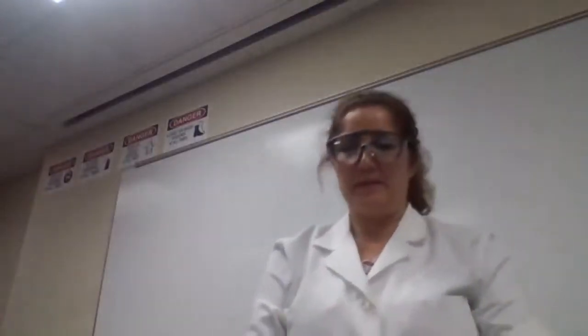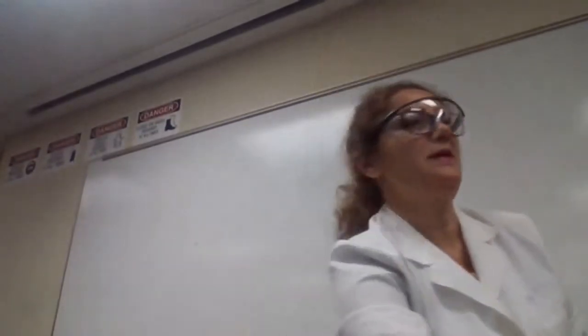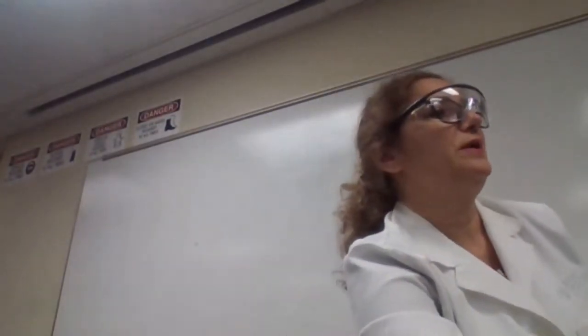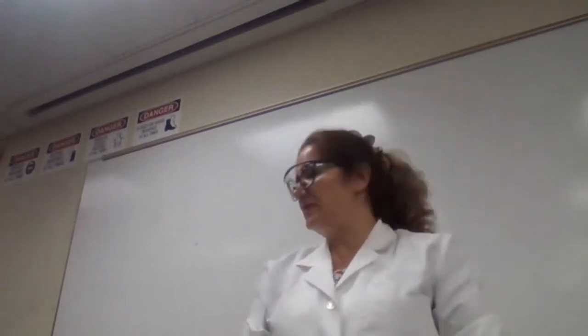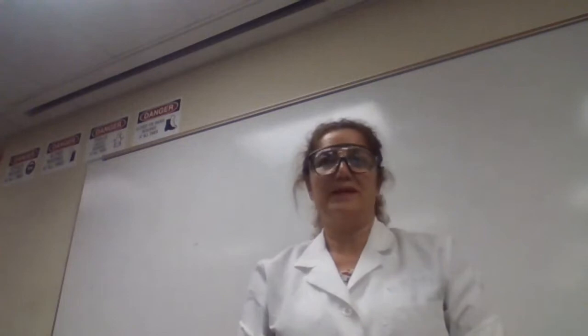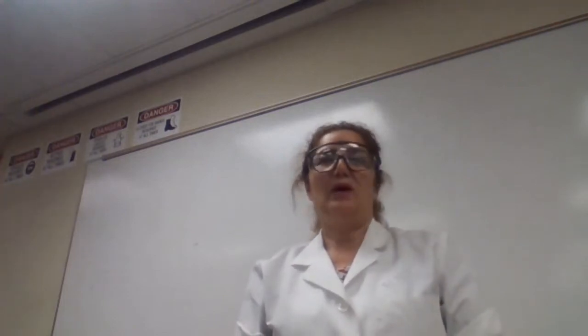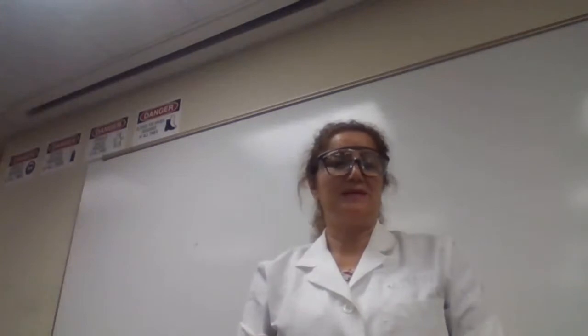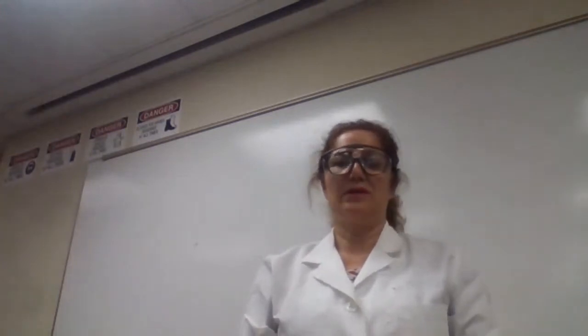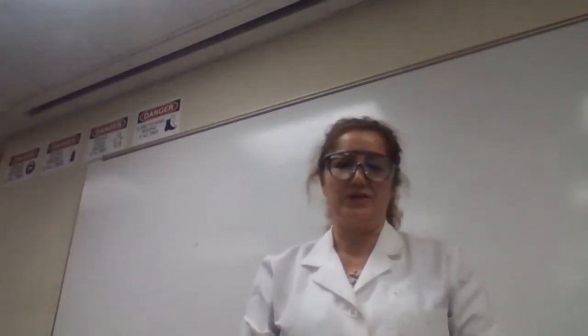Today we are performing an experiment for calorimetry, and we are using calorimetry to determine the specific heat of a metal and also to determine, or calculate, the heat involved in a reaction.